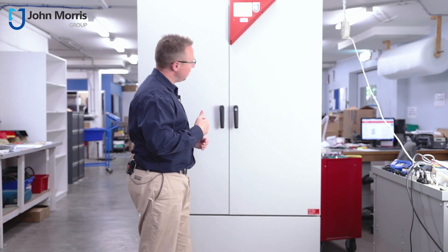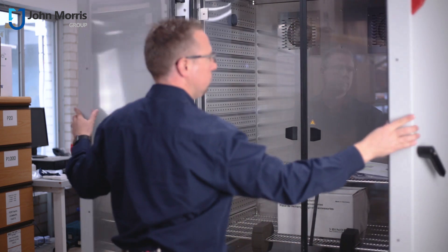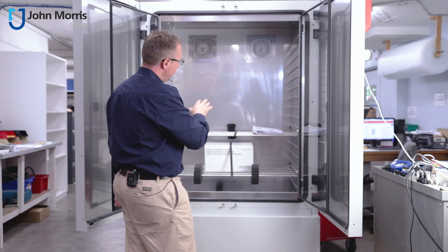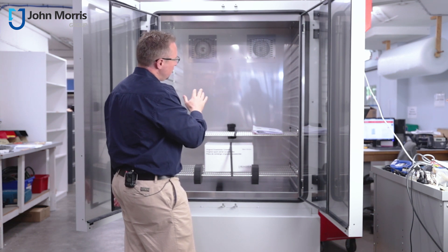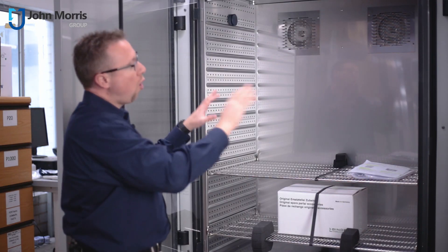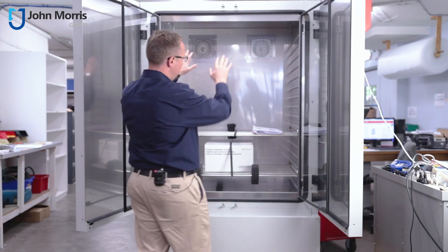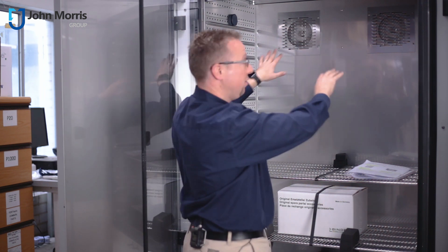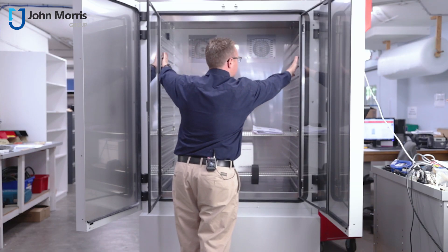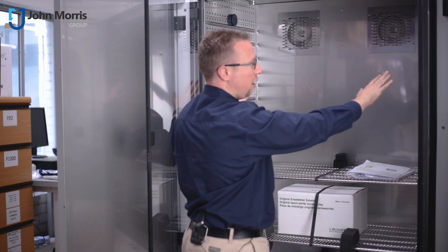Let's open her up and have a bit of a look at the insides of this unit. The KBF series is available in sizes from just over 100 litres to over 1000 litres. One of the reasons you have no hot points and no cold points — homogeneous temperature across the entire device — is because of the forced convection that comes not only from the back of the unit but also through the walls. As I run my fingers down here, you can actually feel the heat coming through these little pores to make sure it's homogeneous across the entire area.